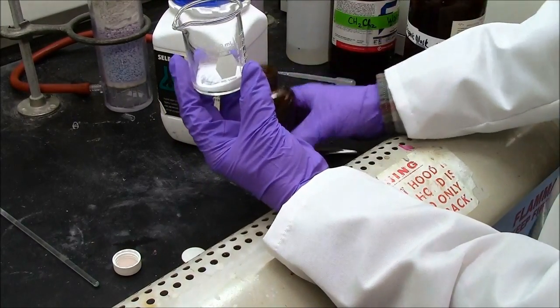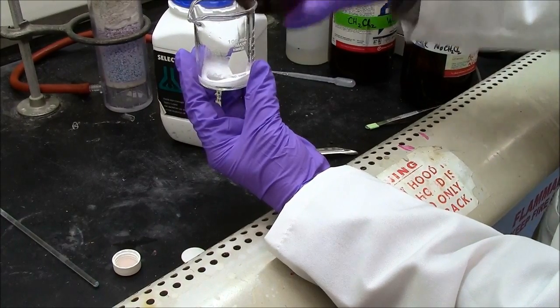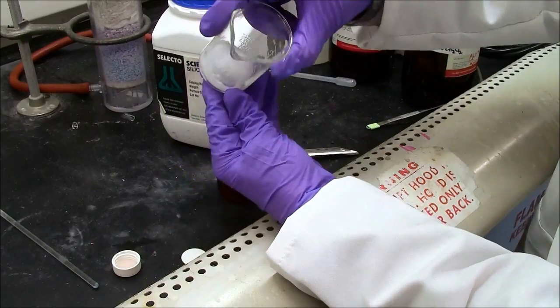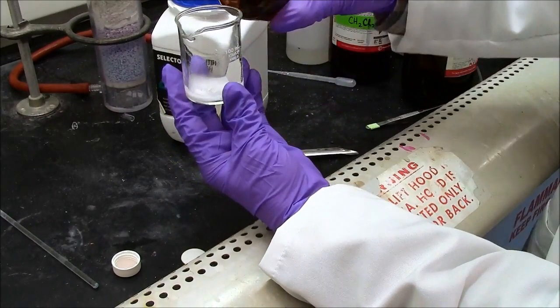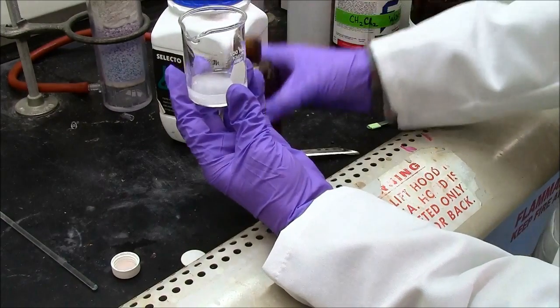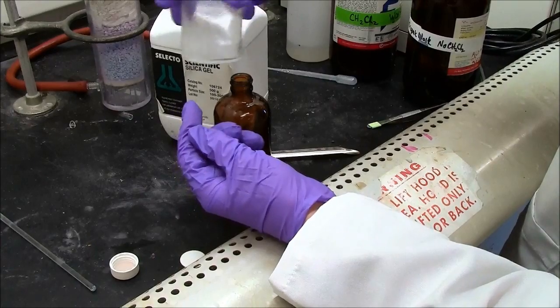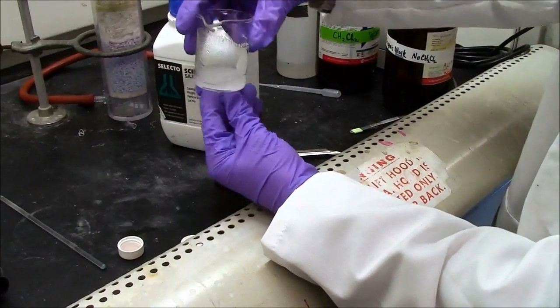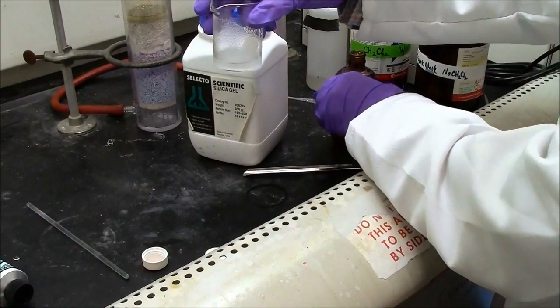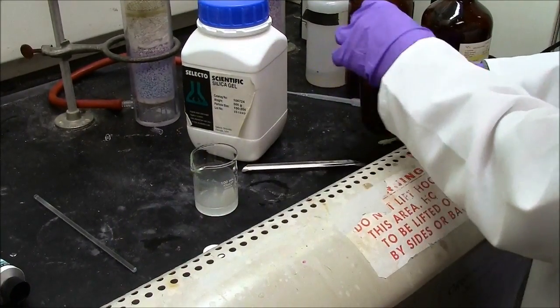So it should be that when you swirl it, the silica moves. So it's fluid. Alright, so maybe about 10 more milliliters. Alright, that might be enough. Yeah, okay, so this is what's called a slurry. You can see that the silica moves, but it's kind of slushy. And that's ideal. So we're now ready to load the column.